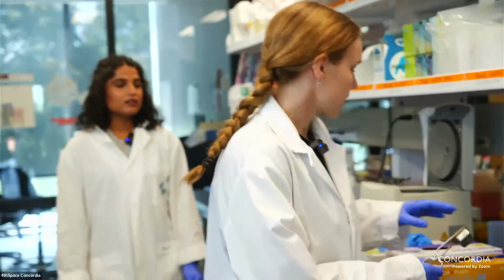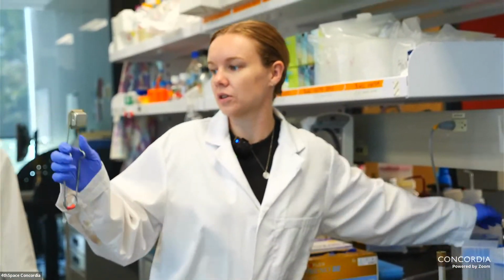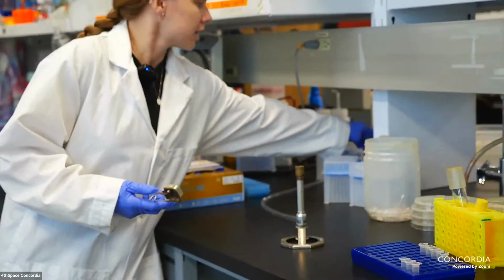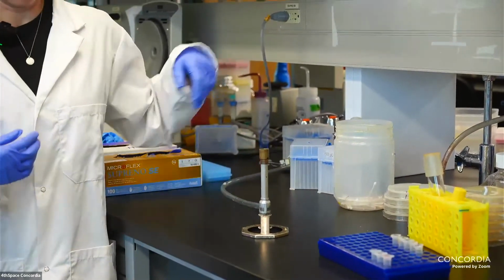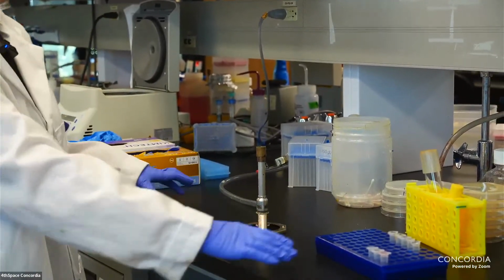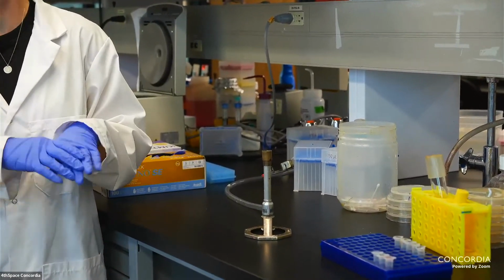What you do to start is light the Bunsen burner. You take this striker, which makes a little spark, turn on the gas here, and light the flame. When the flame is lit, you have about a 1 foot radius around the flame, and that's your sterile environment. That prevents any airborne contaminants from getting into your plates.